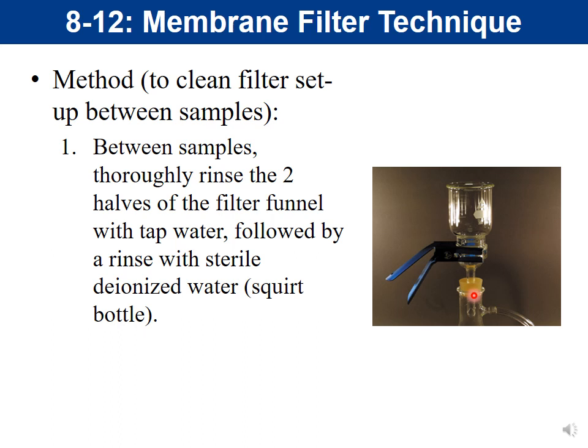So we would have that in a squirt bottle, and we would want to make sure that we rinse the collection cup and the little stopper part that has the filter. You would want to make sure to really rinse those thoroughly to prevent cross-contamination, meaning to prevent carryover from one water sample to the other. And so that's how we would do this setup.